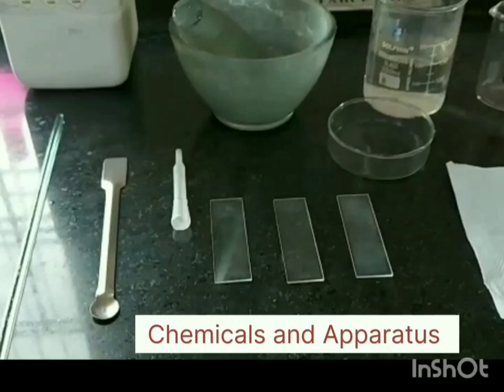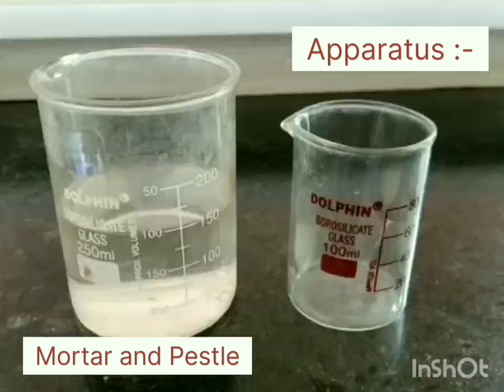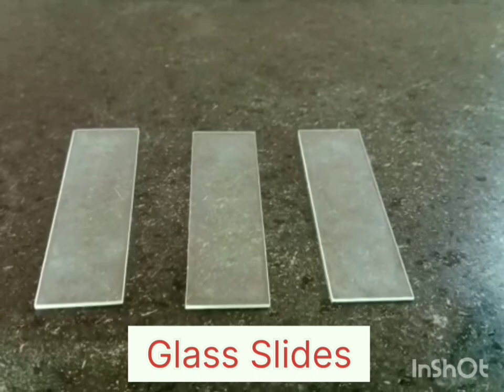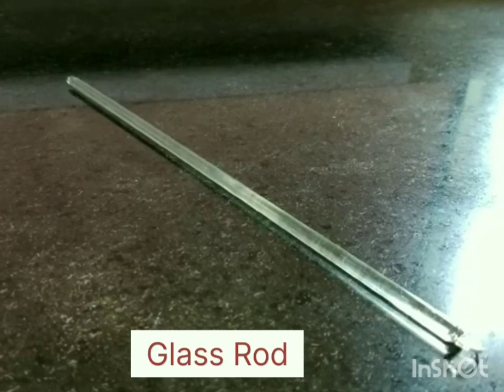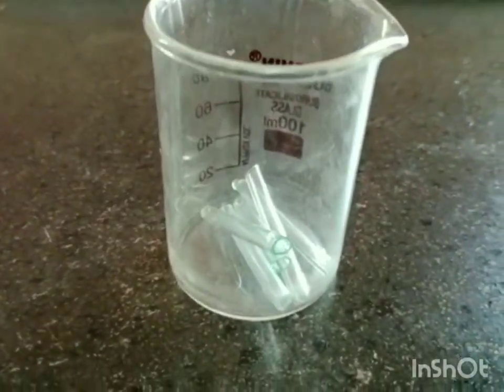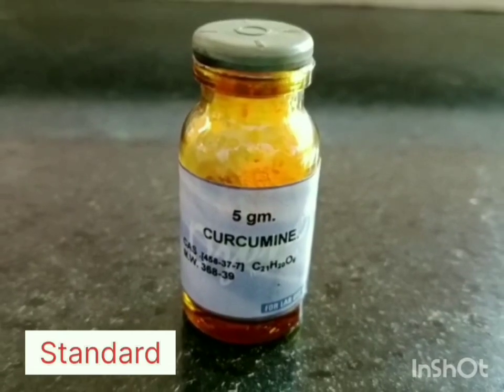we have taken turmeric having main constituent as curcumin. Here are the requirements for this experiment. In apparatus, we have taken mortar and pestle, beakers, Petri dish, glass slides, spatula, glass rod, dropper, and fusion tubes for preparing standard and sample separately. Required chemicals are silica gel G as a stationary phase, turmeric powder as a sample, and pure curcumin as a standard.